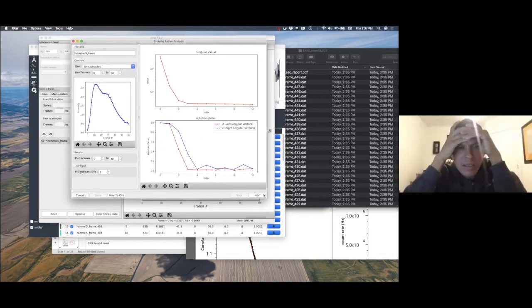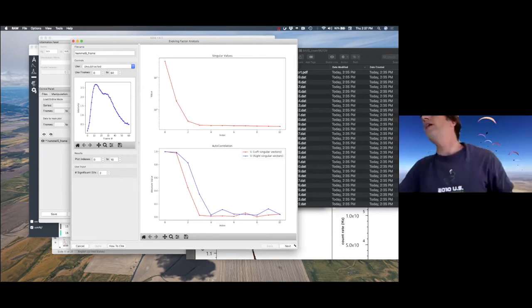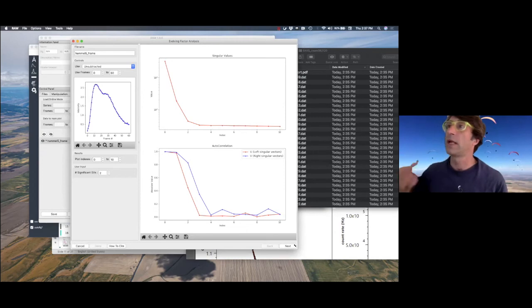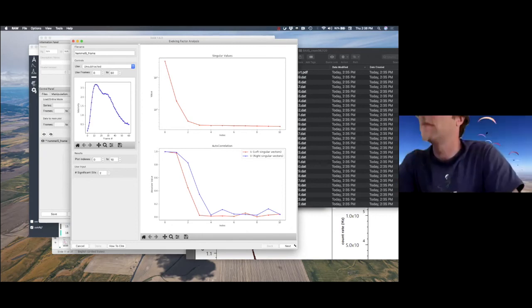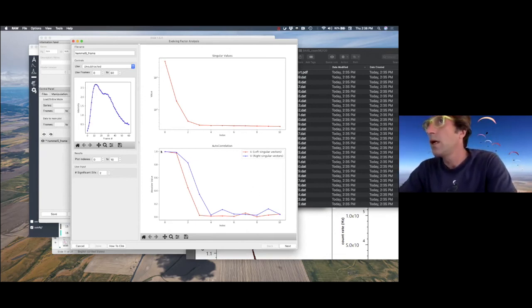The EFA before didn't work very well because the ScÅtter frames that I saved weren't able to be read in RAW, but now it's not a problem. You probably don't know, but before I needed to change the names, headers, and stuff like that. Anyway, so what I want to say is, I upload those, and you immediately recognize there are two components.